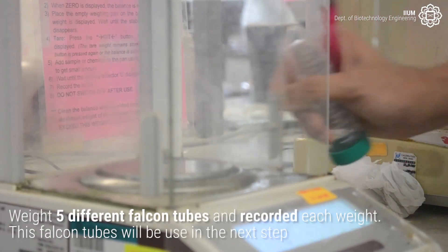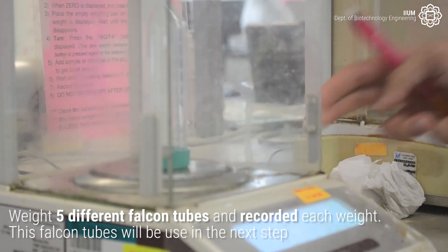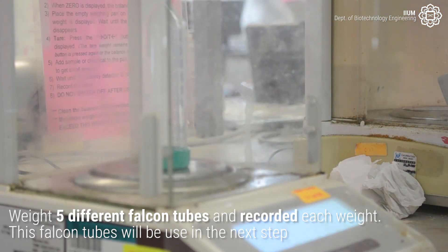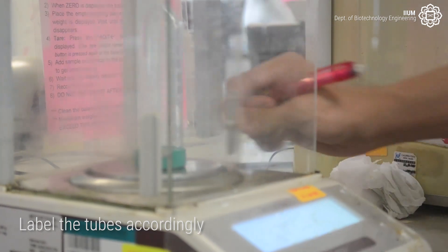While waiting, weigh 5 different falcon tubes and record each weight. These falcon tubes will be used in the next step. Label the tubes accordingly.